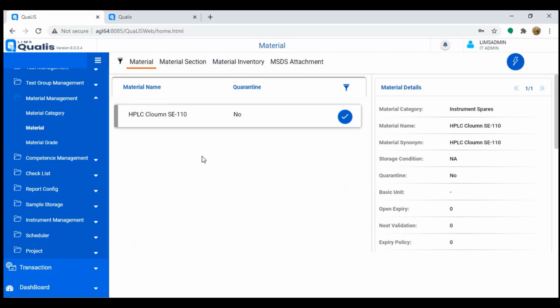Then users will use their own ERP or some other applications. Somebody is using an ERP and he wants to do some information exchange between LIMS and ERP. We can build that bridge between these systems. Of course, it is configuration work and there are extra man-hours and costing involved. But yes, we have done ERP integration in our experience. It is possible.